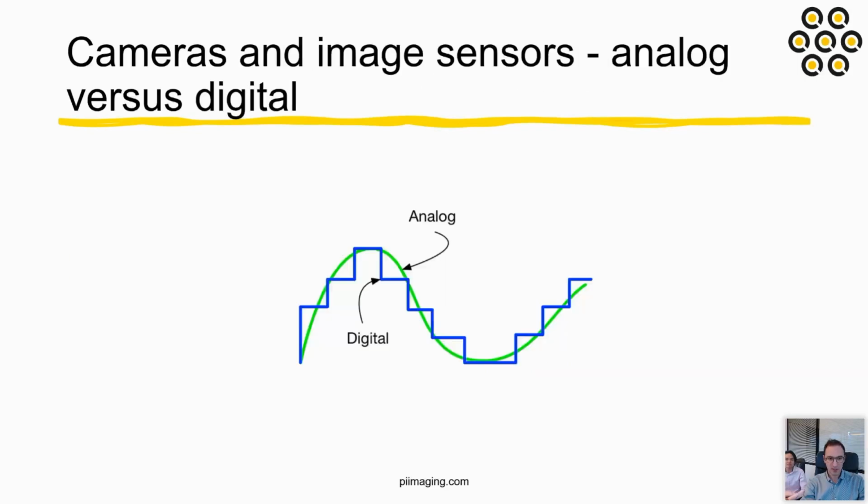So now I will switch more to comparisons between cameras and image sensors. And I would like to reiterate the fact that we are really a digital camera. When I say we, I mean SPADs, compared to other analog sensors like CMOS, scientific CMOS, EMCCD, and ICCDs.